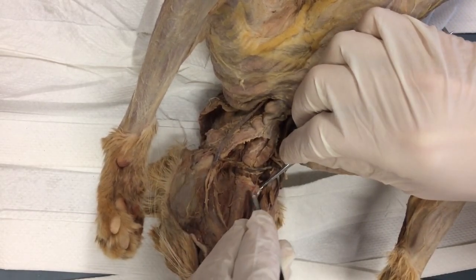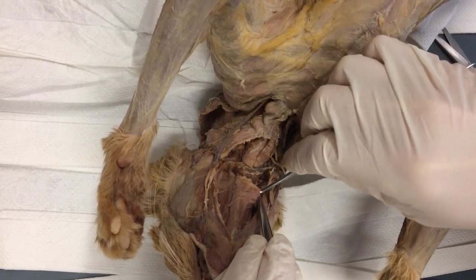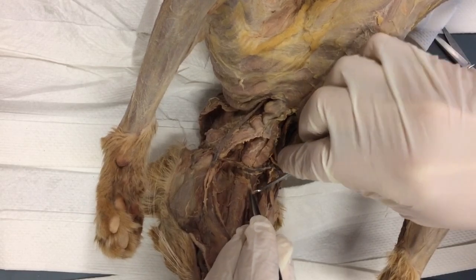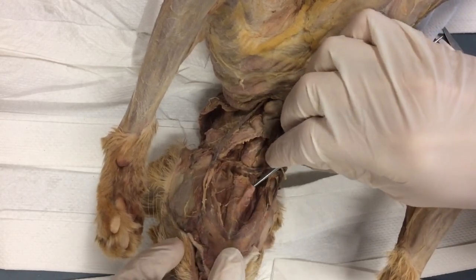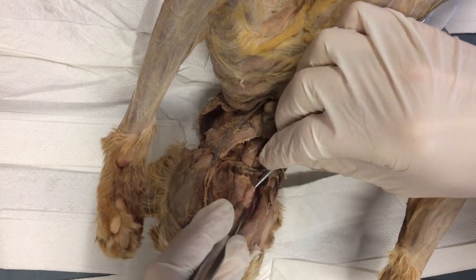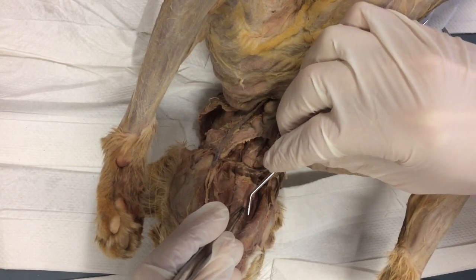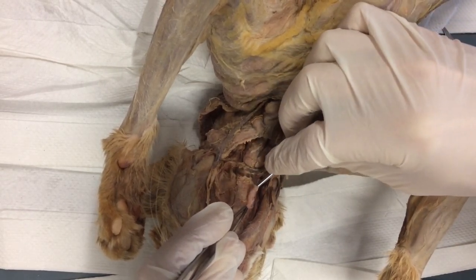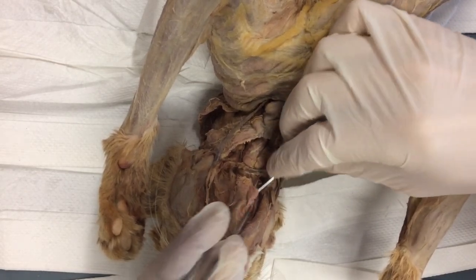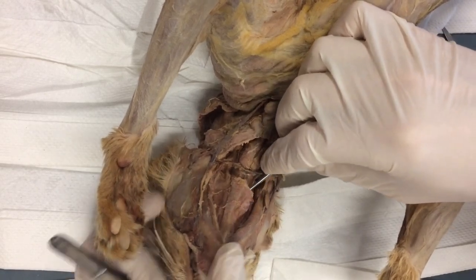Now you will not be able to go through the center line. You'll be able to go right to it. See the nose underneath there? And again, you're dissecting blind on feel. Just nose wiggling. Look. Wiggle, wiggle, wiggle. A little bit of support, and then I'm going to roll this tool and drag this way. Watch. Roll and drag. You won't be able to see it under there. And I'm just clearing this off. All right. Now I got that side mostly done.